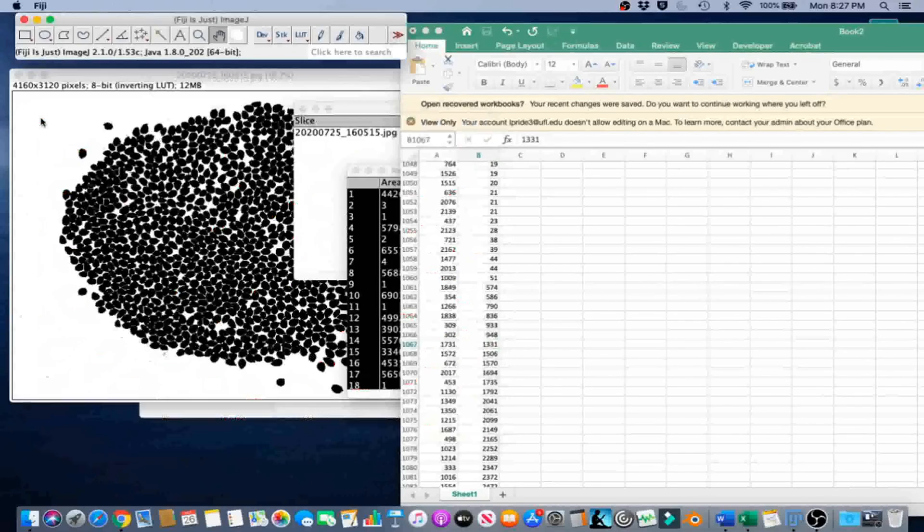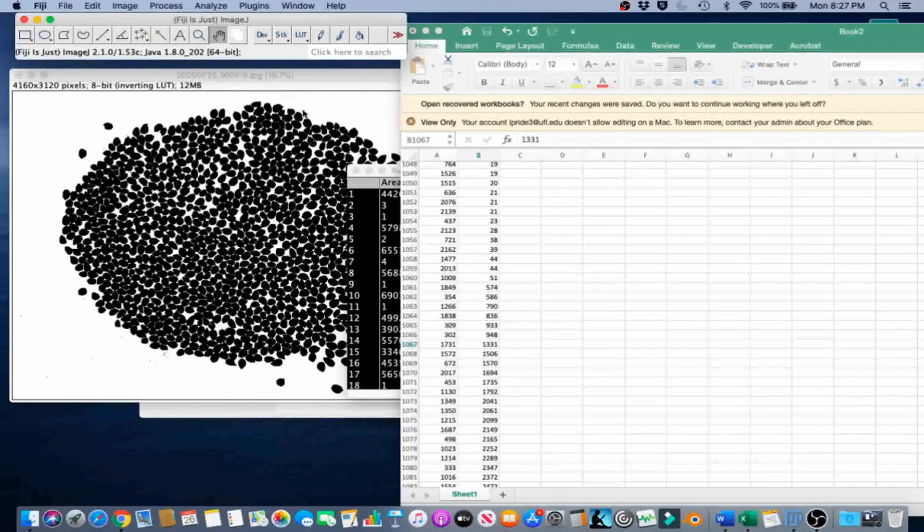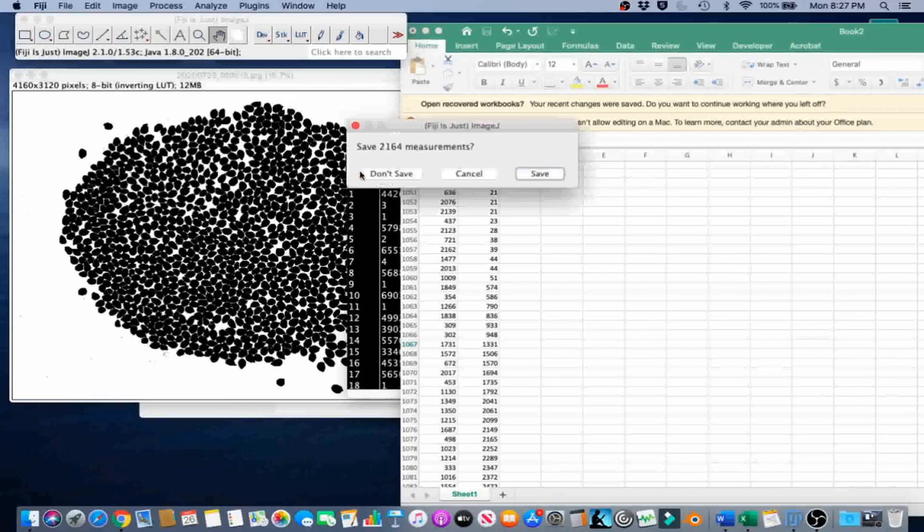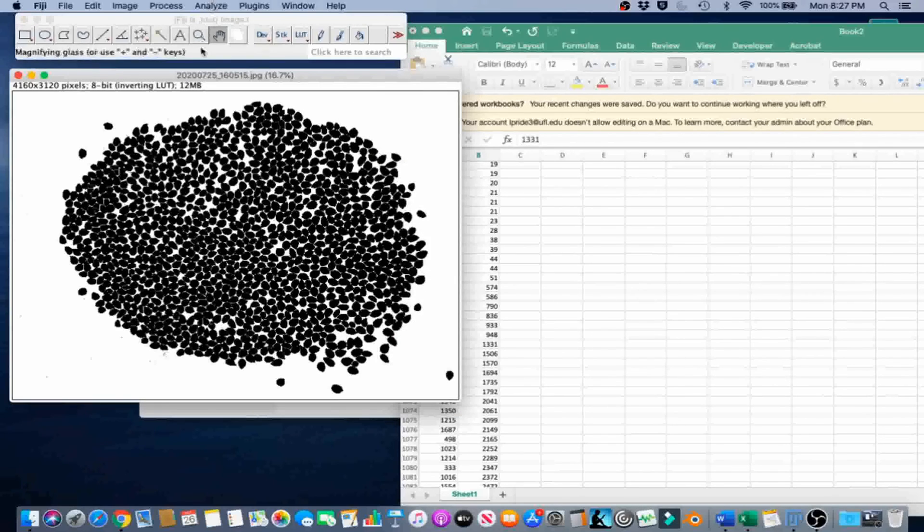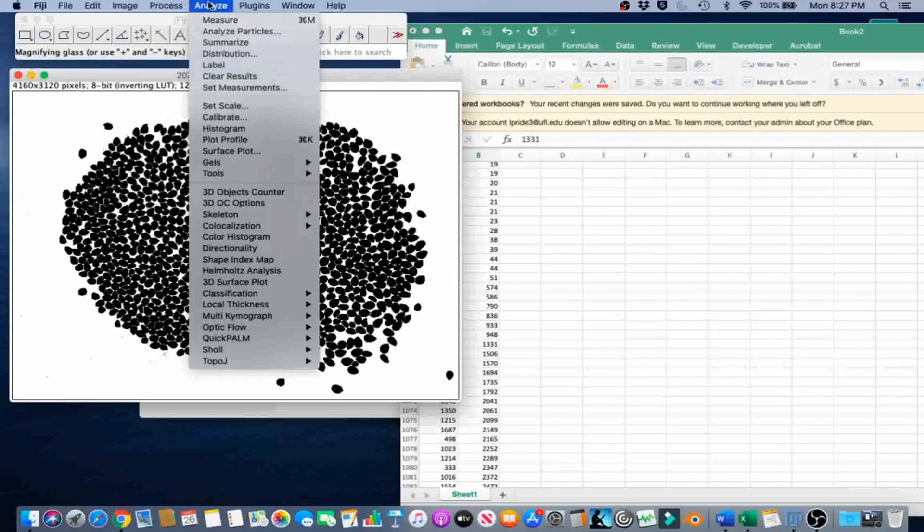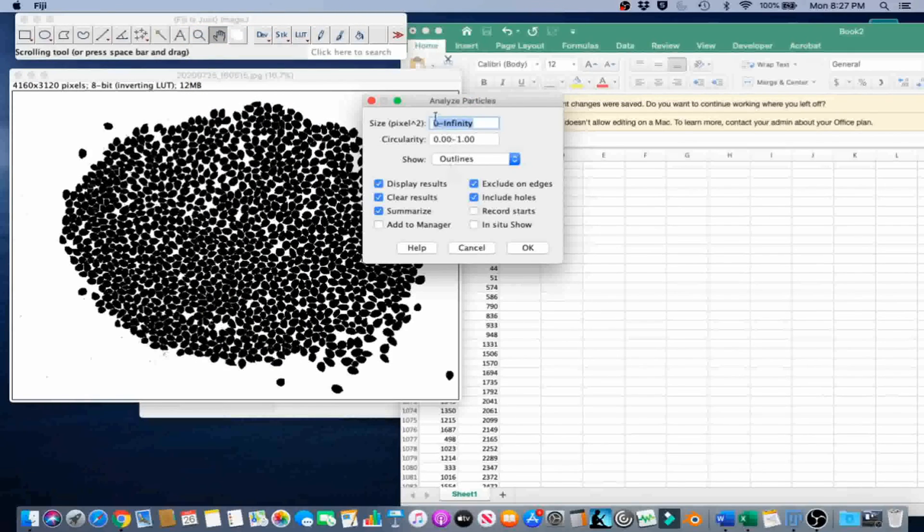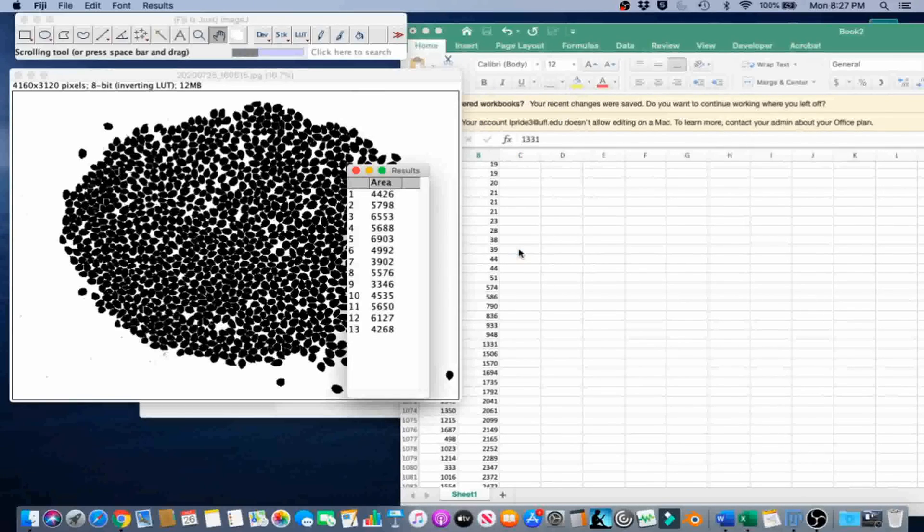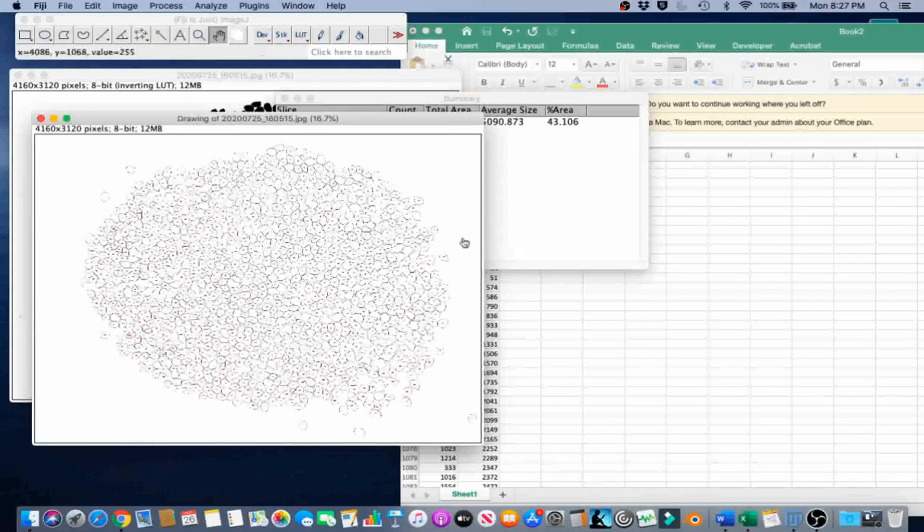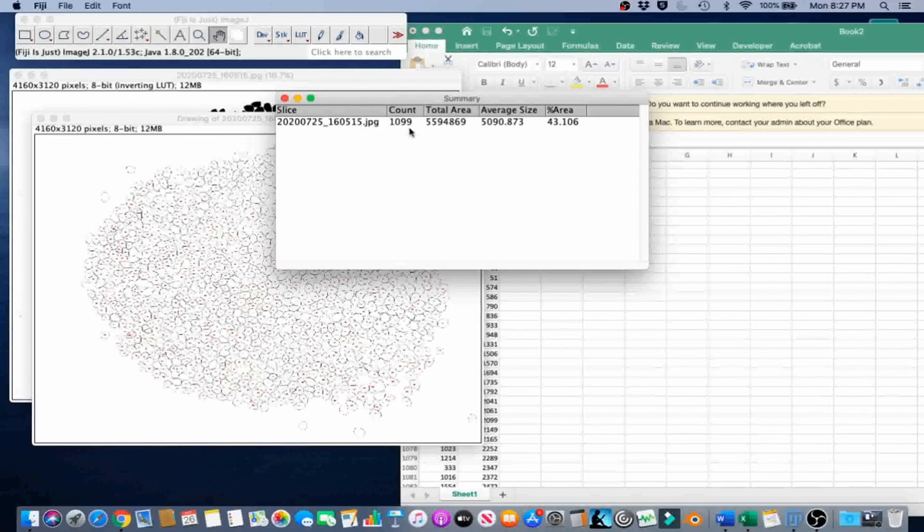And then we're going to do this again. We're going to analyze, analyze particles, size in pixels, lower value, 1331. Everything else can be the same. And now, according to ImageJ, we have 1099 seeds, which seems about right, honestly.